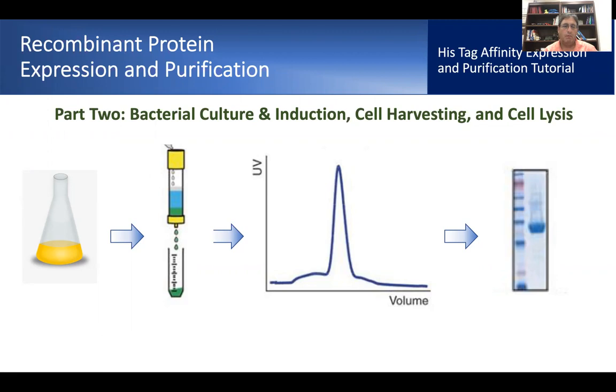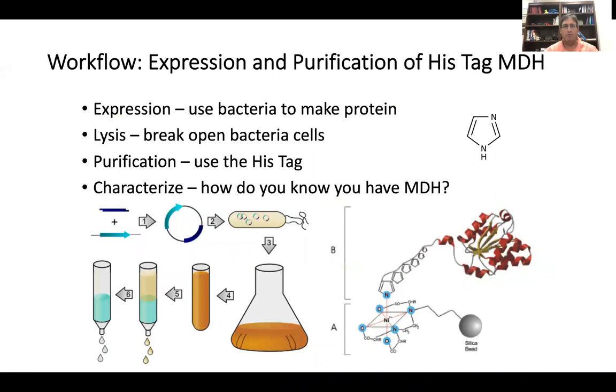Hello and welcome. Now we'll talk about part two: bacterial cell culture, bacterial cell protein expression or the induction of expression, how to centrifuge or harvest the cells, and how to break the cells. So the overall workflow is just this.